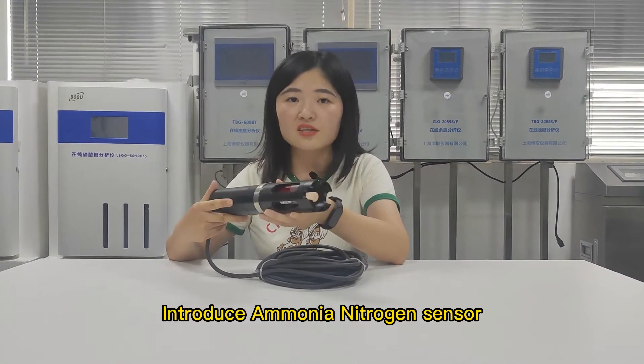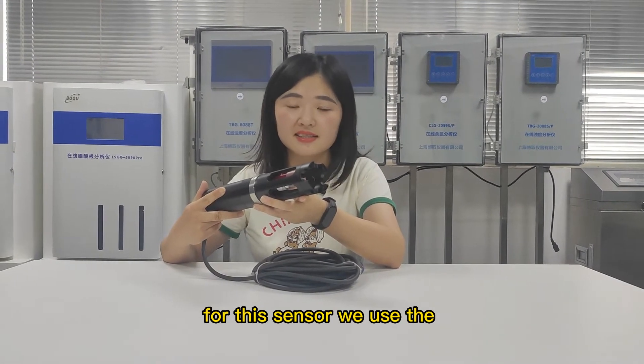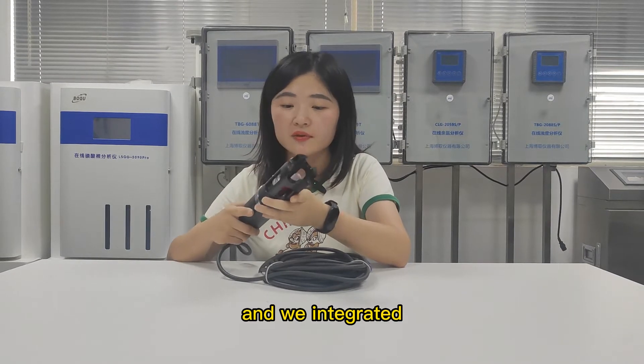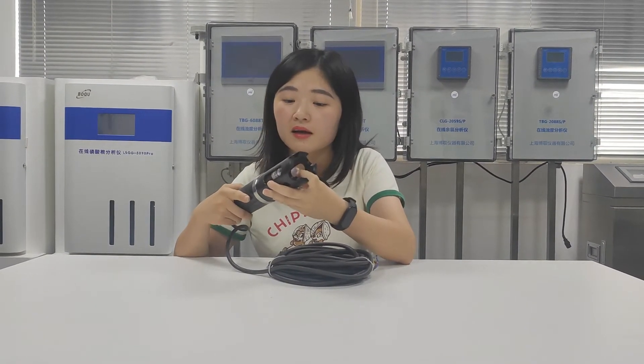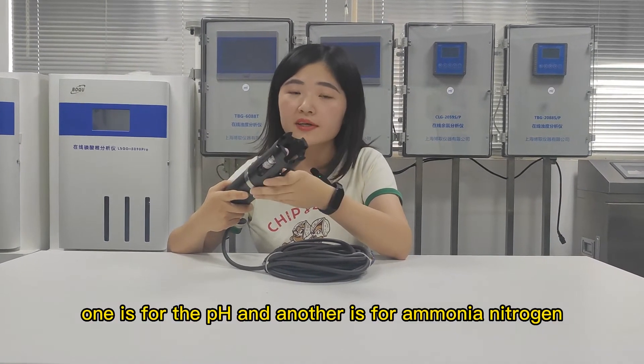Introducing the ammonium nitrogen sensor. For this sensor, we use the ion selective method principle, and we integrated two sensors in one unit — one for pH and another for ammonium nitrogen.